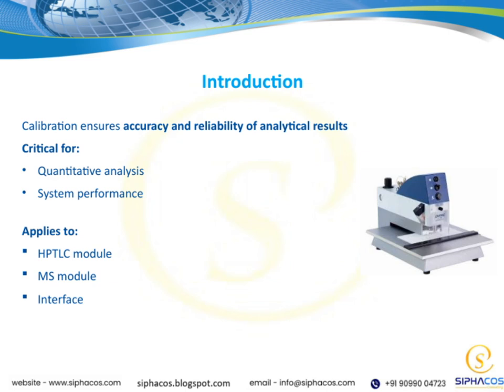Now, calibration isn't just a one-time thing. It applies across different modules and interfaces. For example, the HPTLC module needs calibration to deliver precise chromatographic results. Similarly, the MS module relies on calibration for accurate mass detection. And of course, the interface itself must be calibrated to ensure seamless communication between components. In essence, calibration acts as a foundation for quality in our analytical workflows. It's vital for producing trustworthy results and keeping our systems running smoothly throughout their operation.